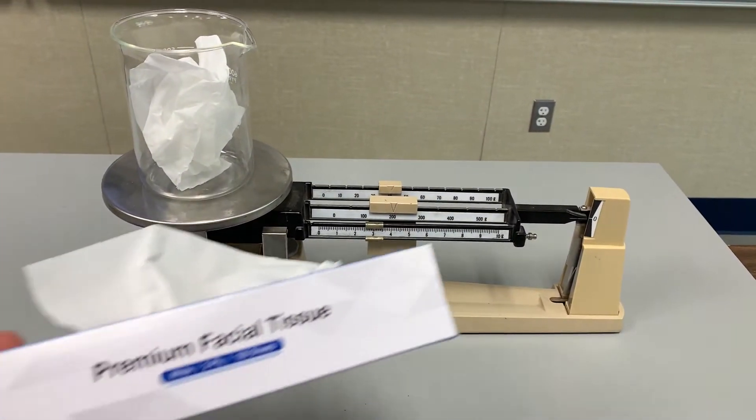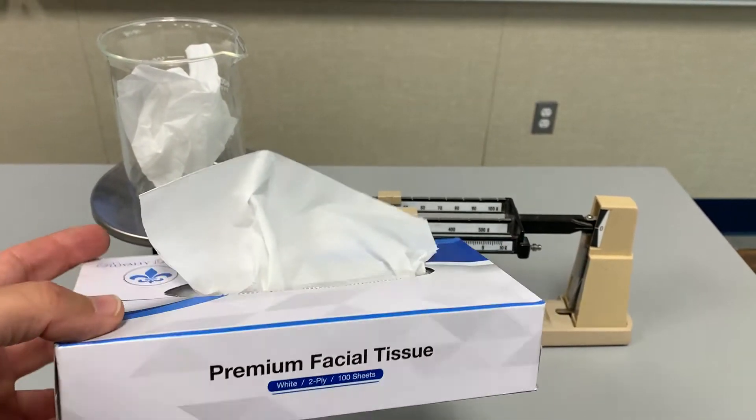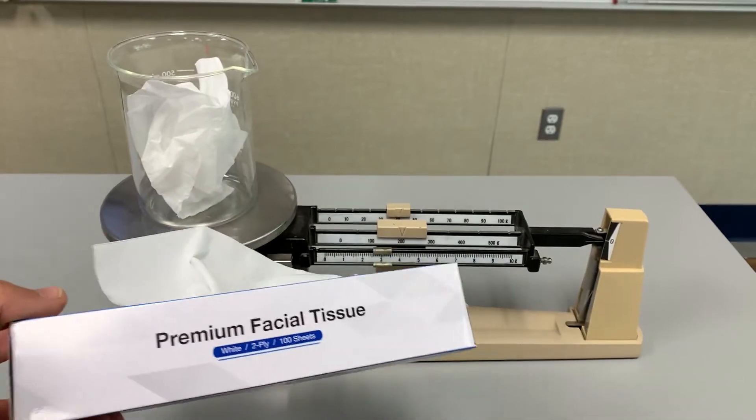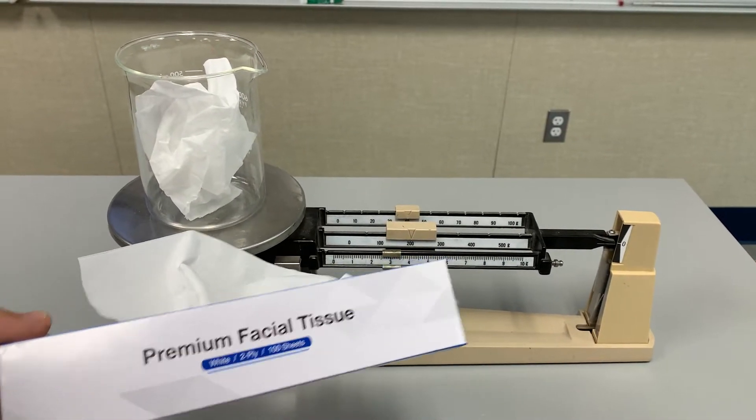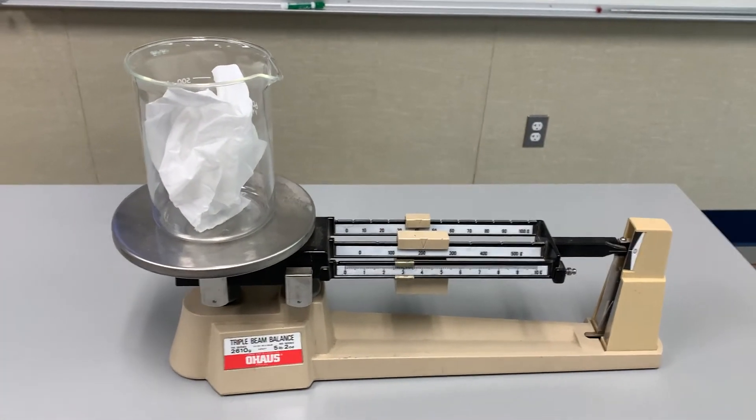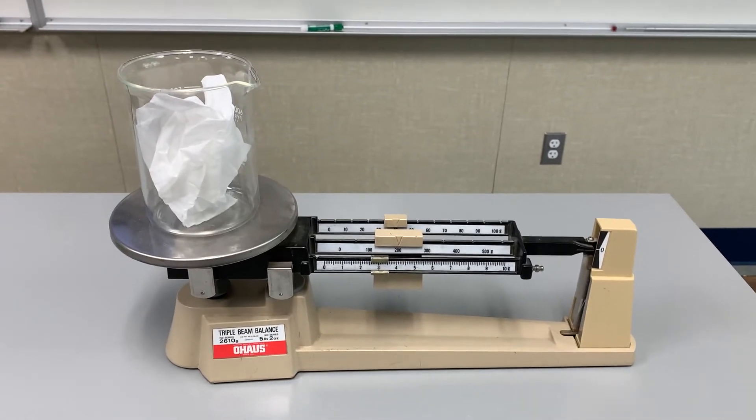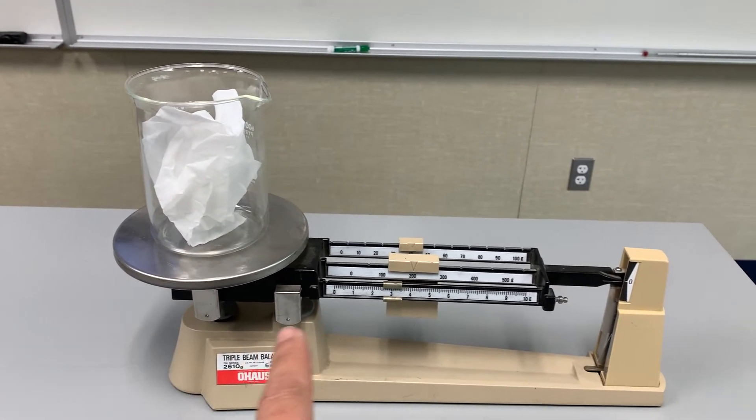To do this experiment, I've got a piece of facial tissue which is made of wood, essentially. Technically it's called cellulose in the scientific world. I'm going to burn this inside this beaker on this triple beam balance.